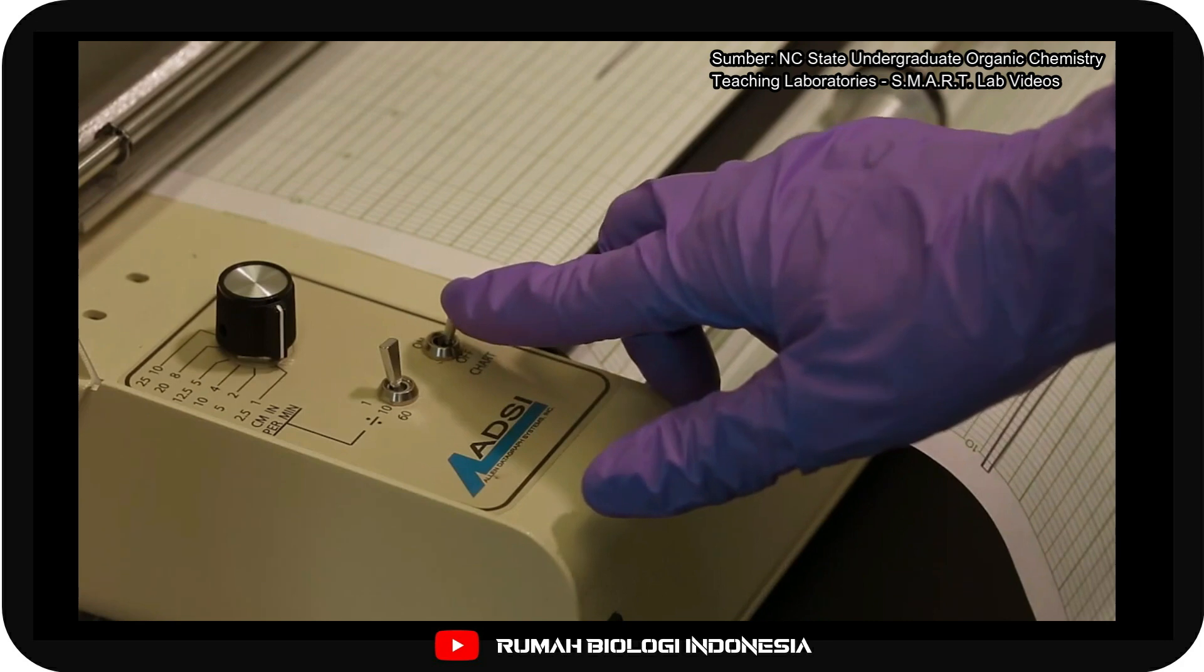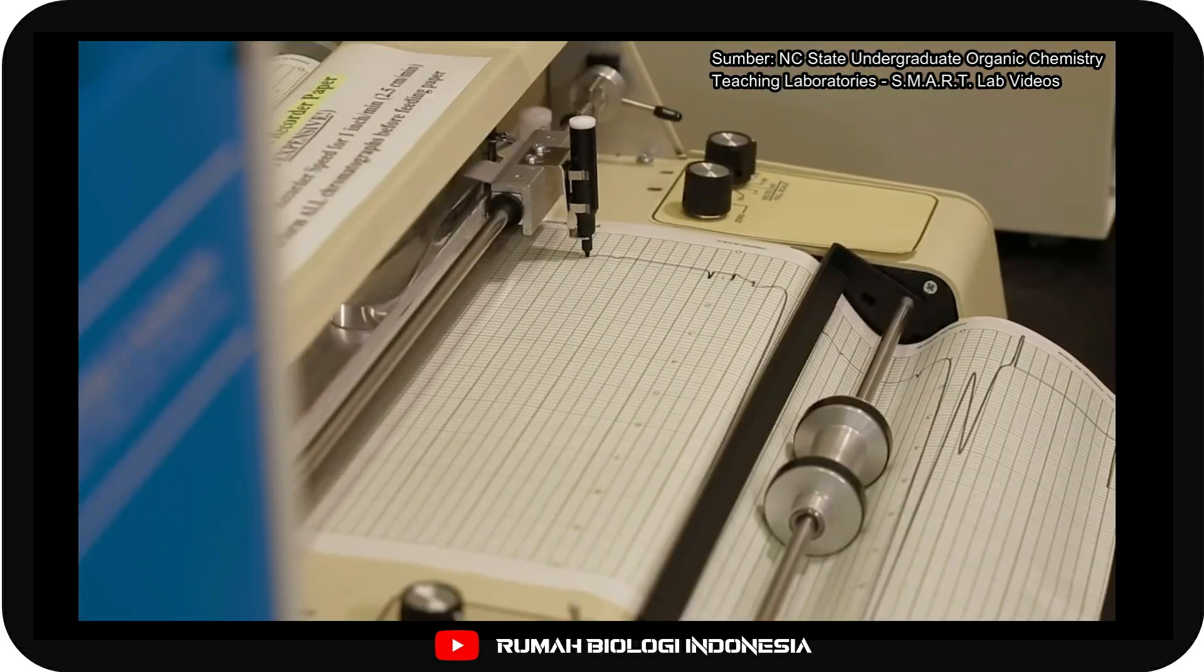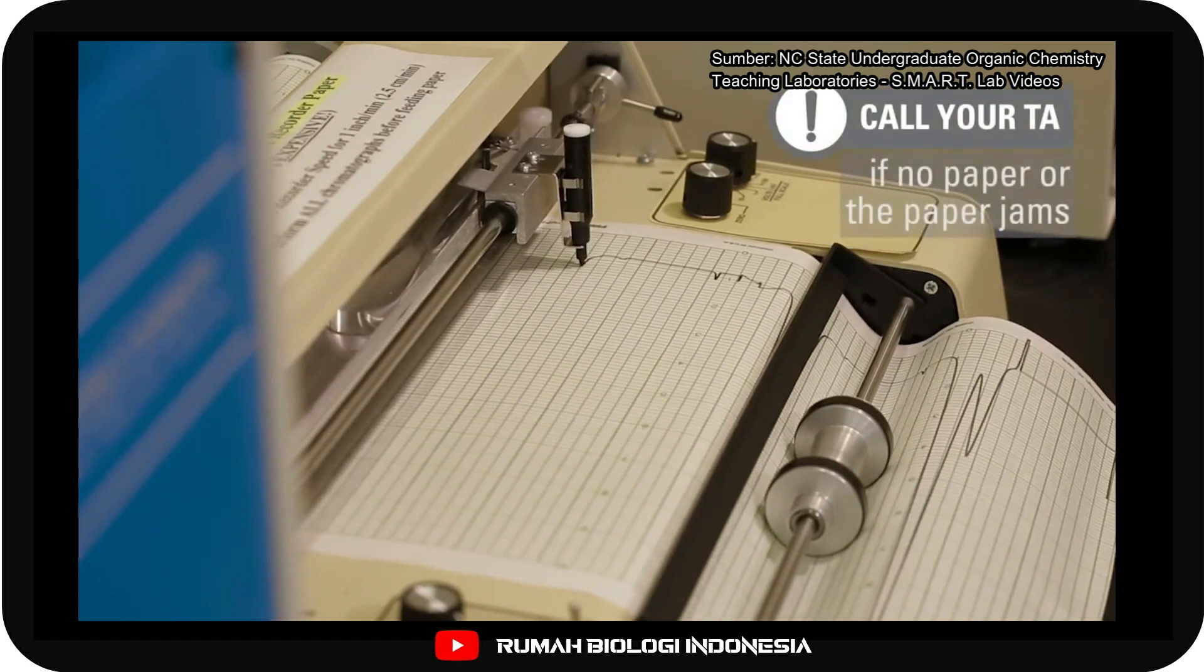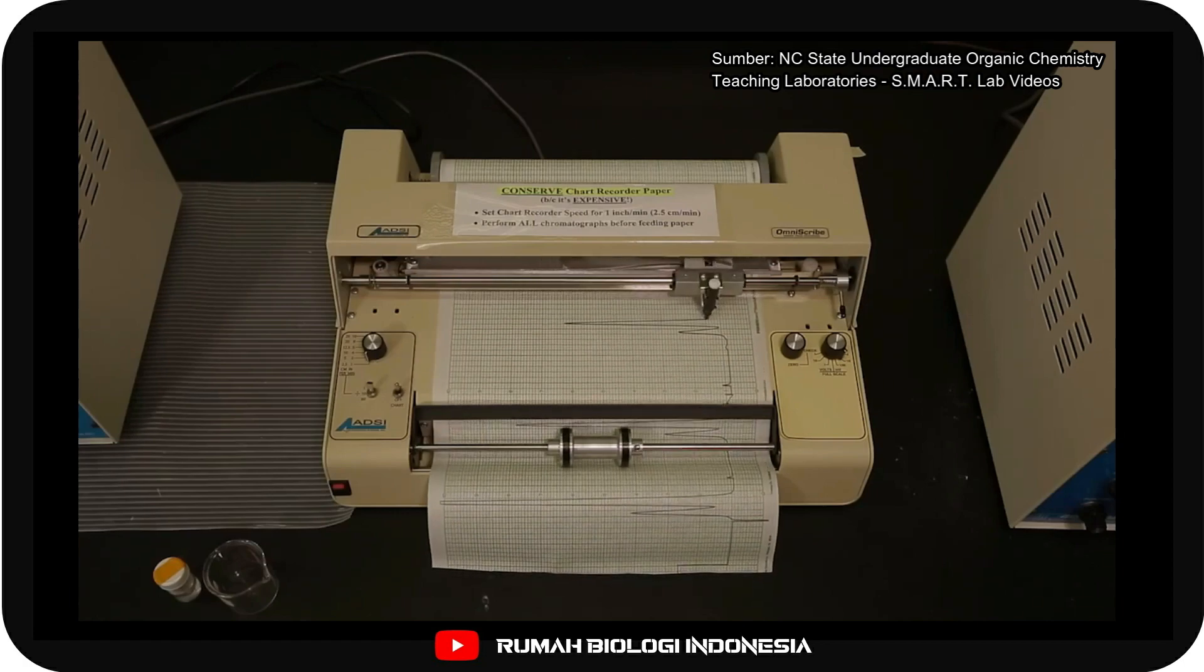At the same time you inject the sample, turn on the chart recorder. Make sure it is recording by checking the chart paper feed. If there is no paper or the paper jams, contact the TA for assistance. Wait until the entire sample has run through the column.